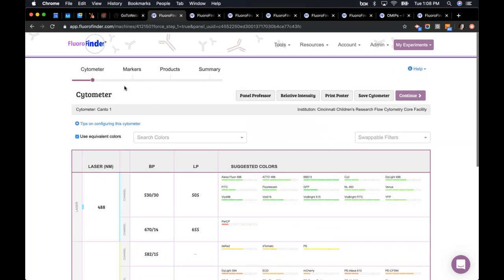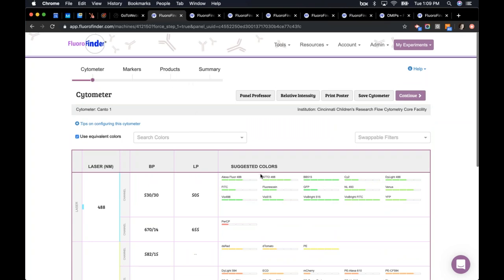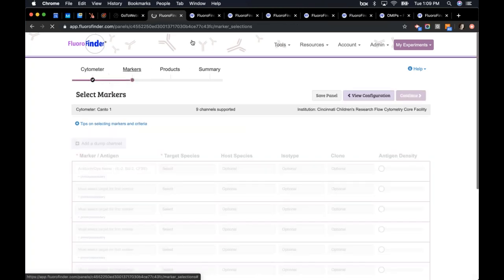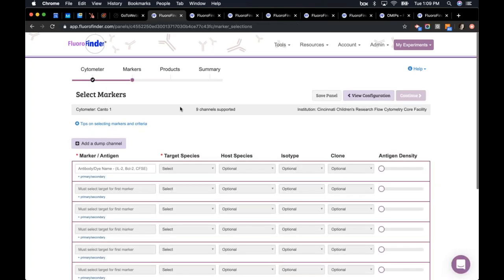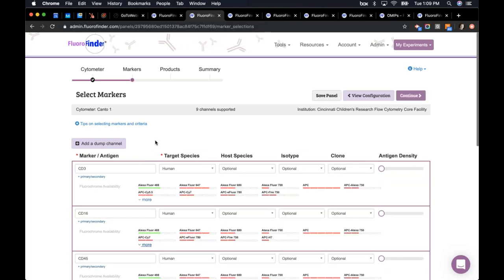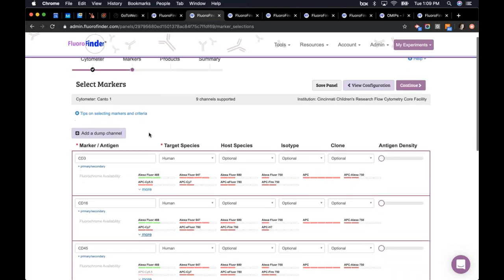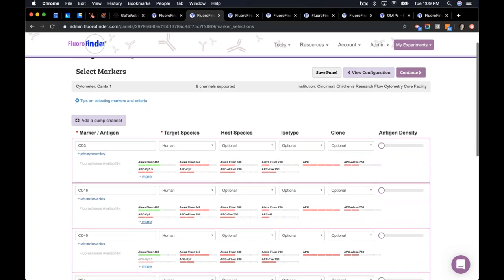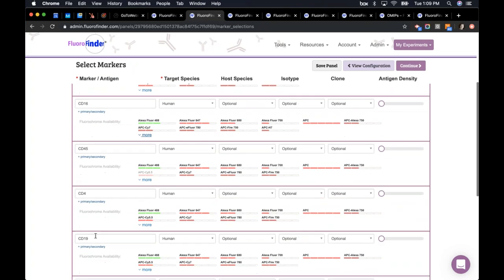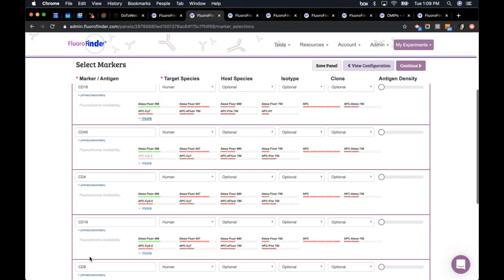There are four main pages on FloraFinder: the cytometer page, markers page, products, and summary. Once you get familiar with the machine, you're generally going to skip the cytometer page and go right to the markers page. On the markers page, I've entered CD3, CD16, CD45, CD4, CD19, and CD8.